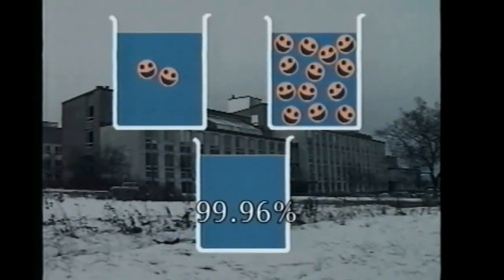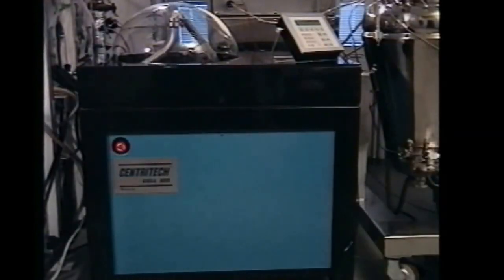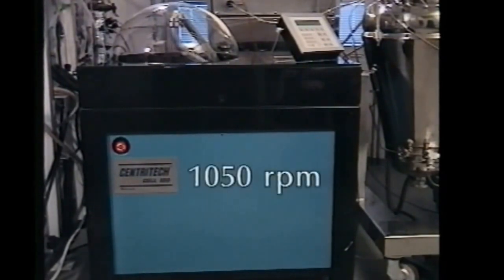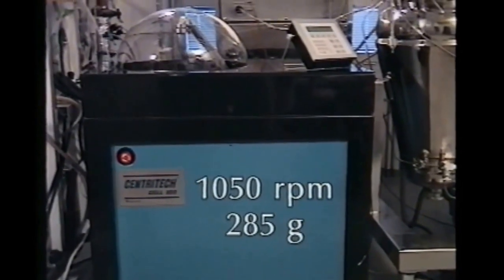The clarified liquid separation efficiency was 99.96%. Incidentally, these figures were obtained using a rotor speed of only 1,050 RPM, giving the relatively low centrifugal force of 285 G.